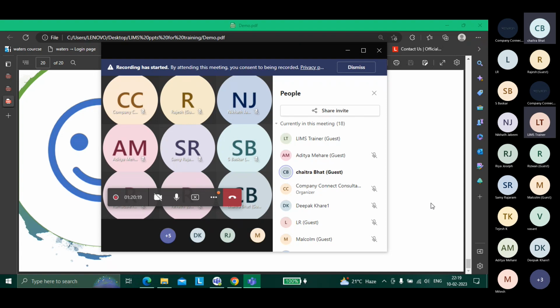Okay, one session you can take. There are separate projects, let me be very honest. There is one project where they are creating static data, master data. There is another project where they are creating reports in bulk, at the back end. We don't know, but there may be some other IT companies who have separately got this project for creating worksheet and workbook in ELN, they are automating this, they are talking to the client, those are in-depth separate things. There are some teams who are only working on LIMS basic code, who are creating the LIMS basic code. They are only working on subroutines.